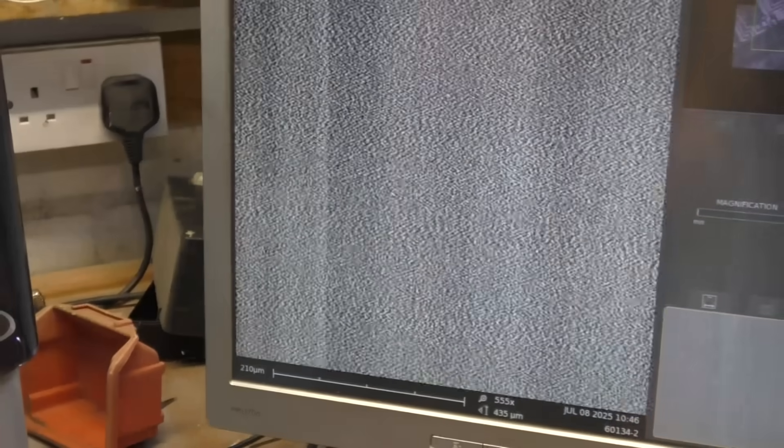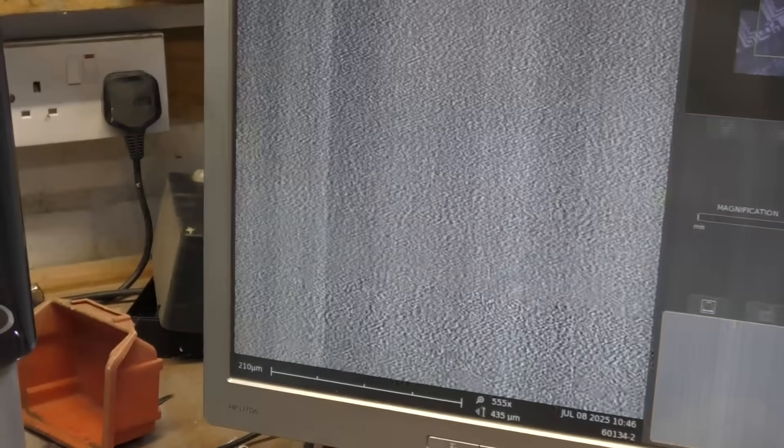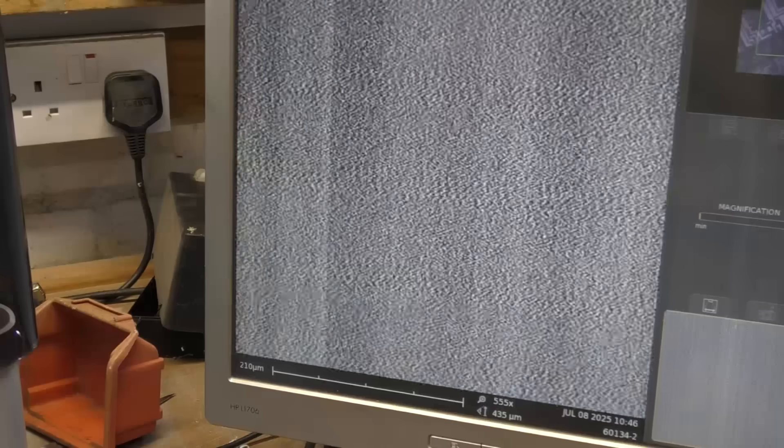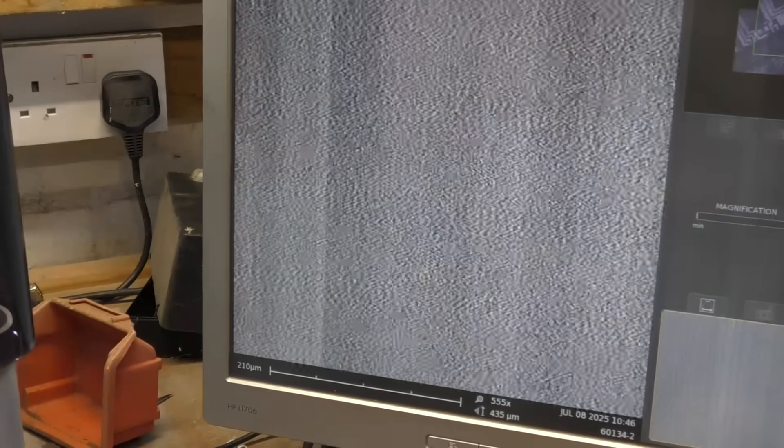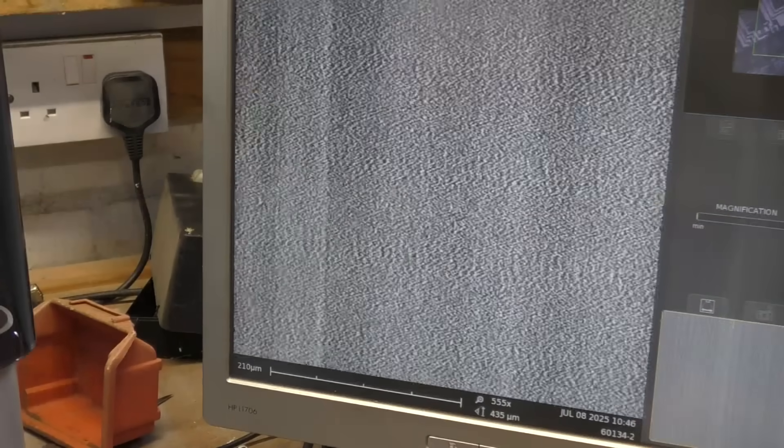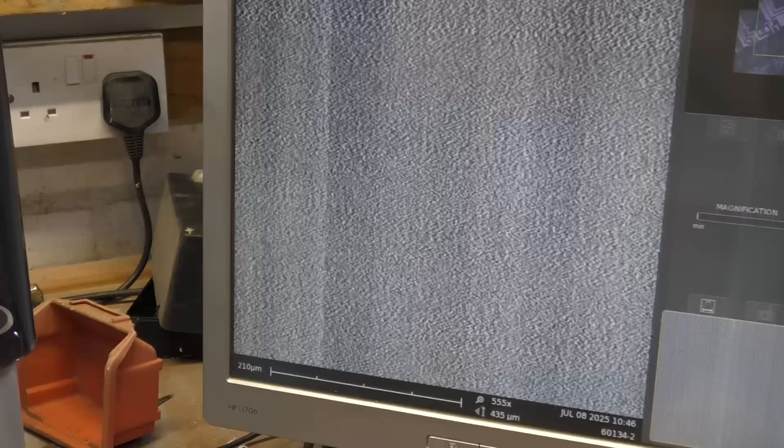All we see is a ton of noise. I've tried all the various magnification and focus settings and there's no difference at all.